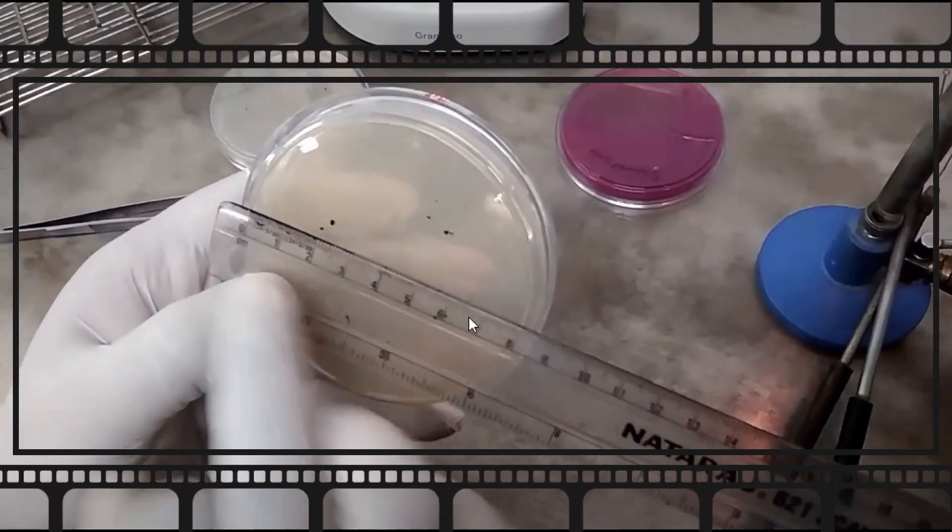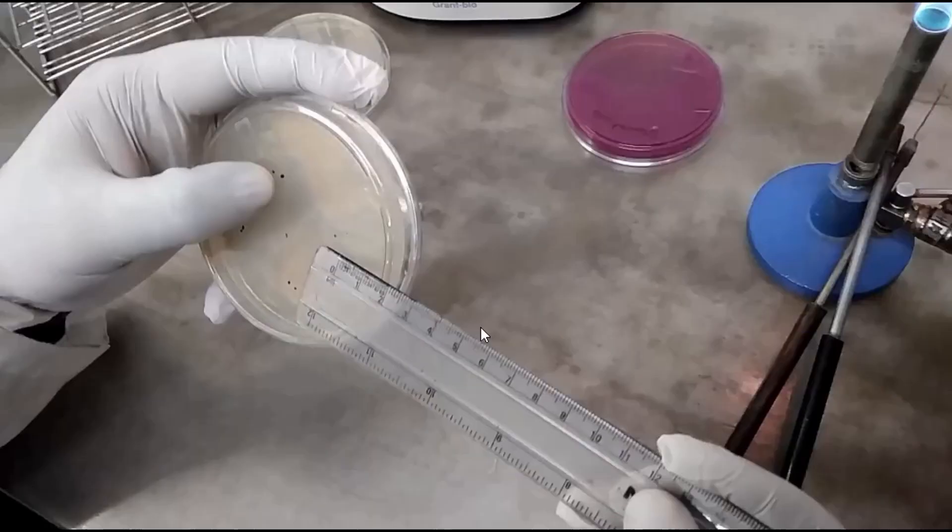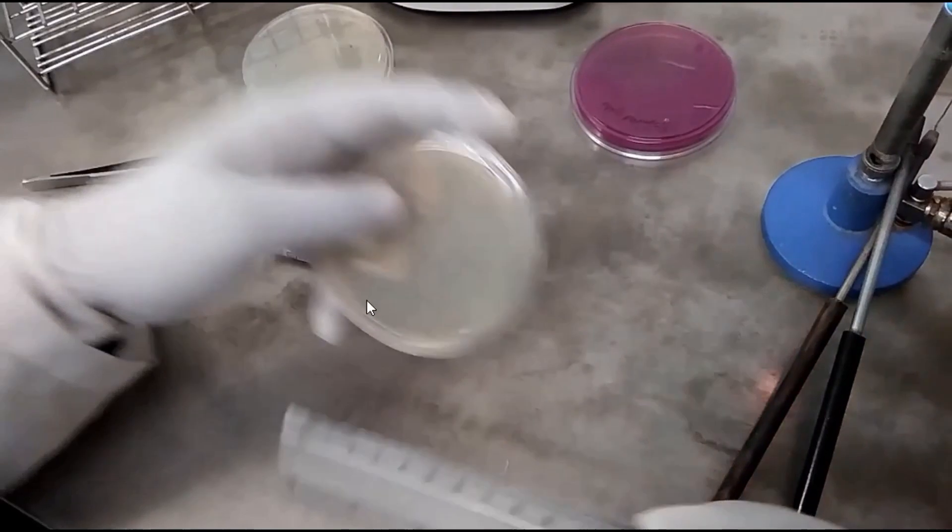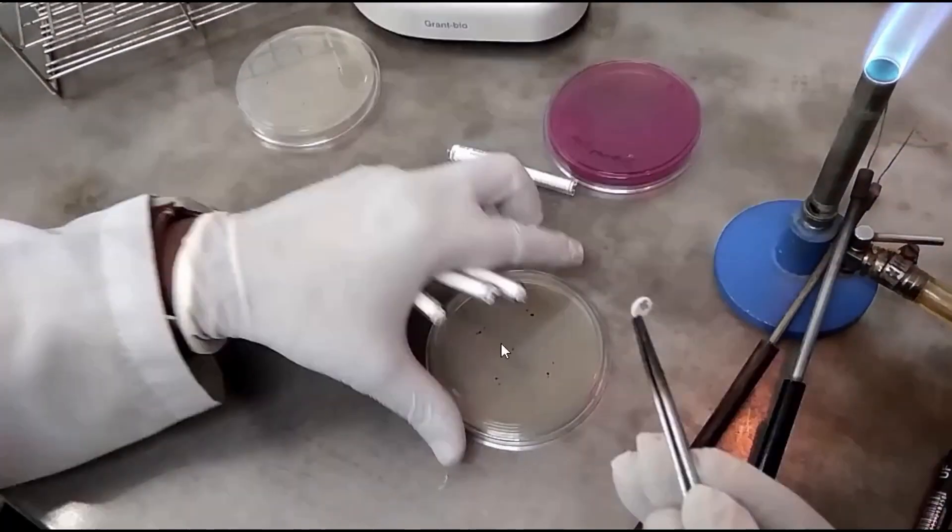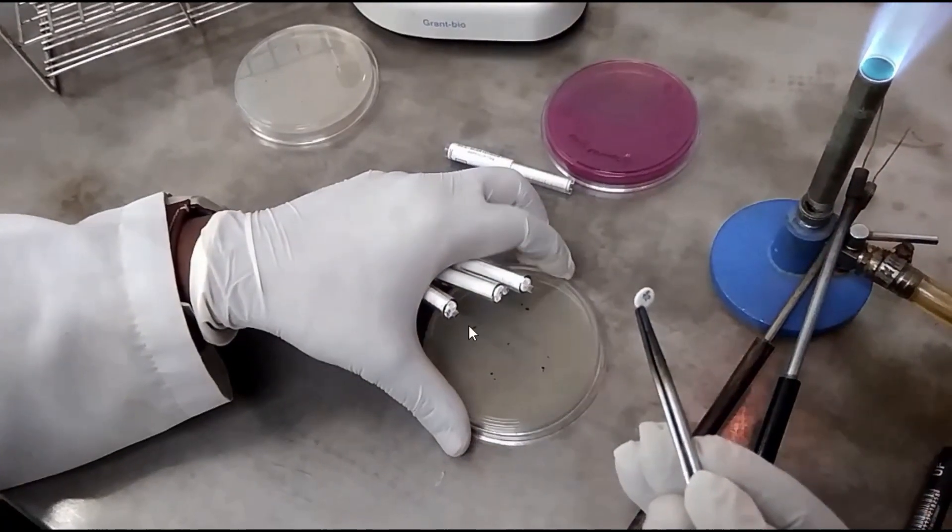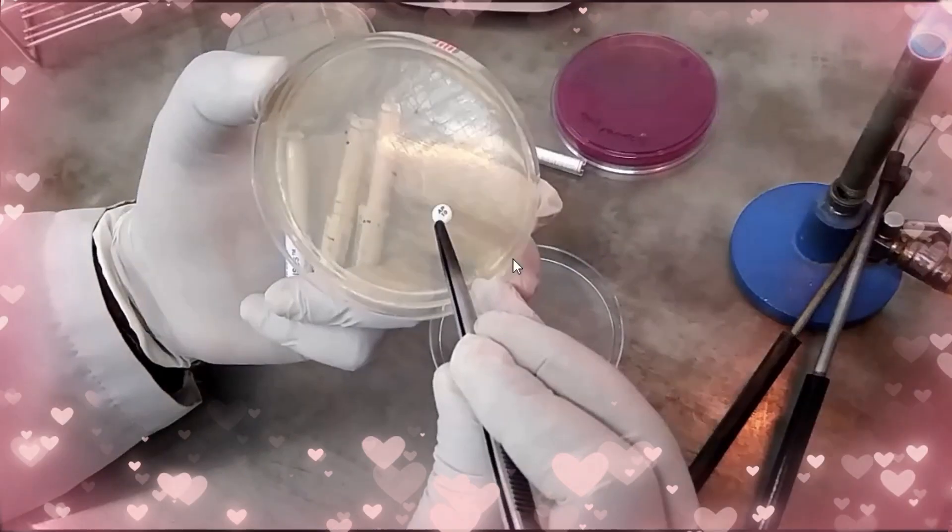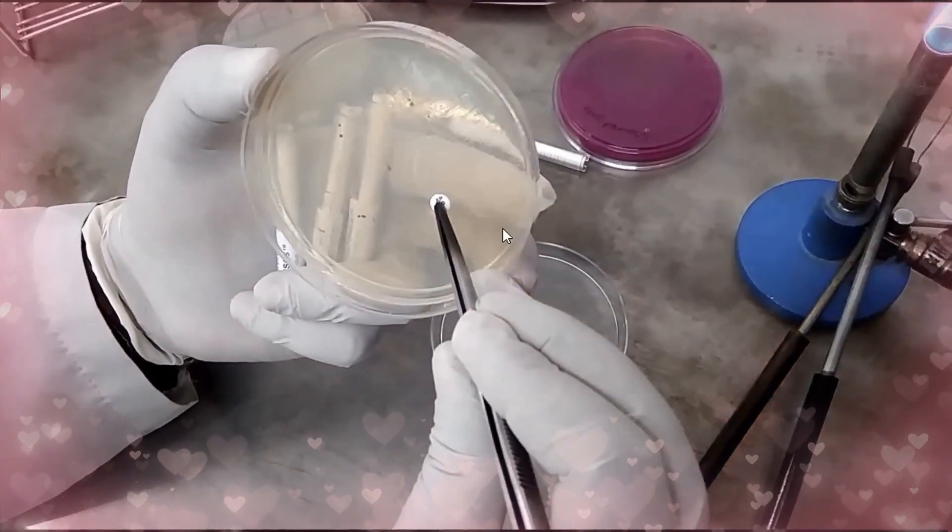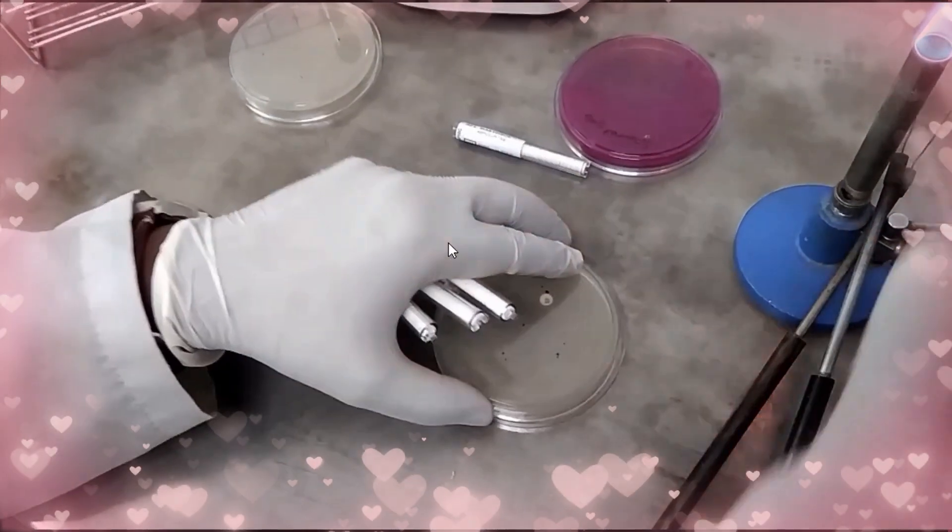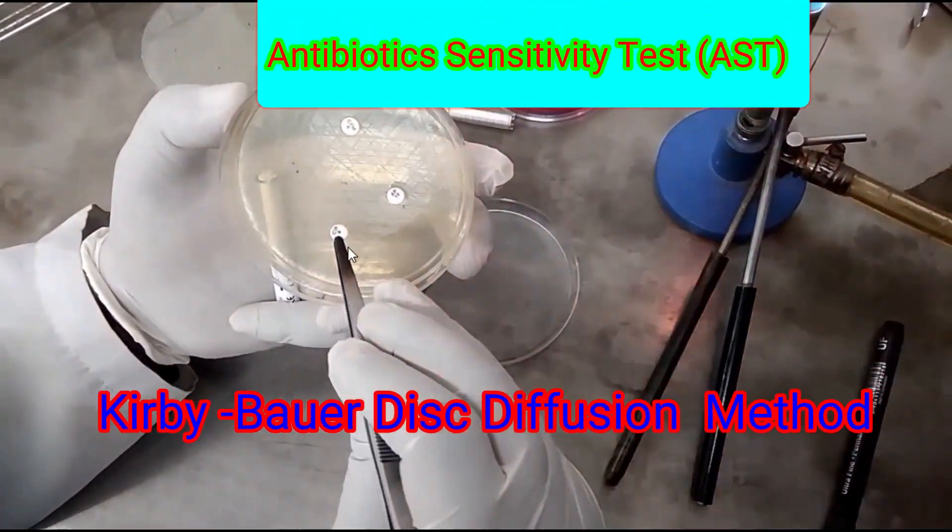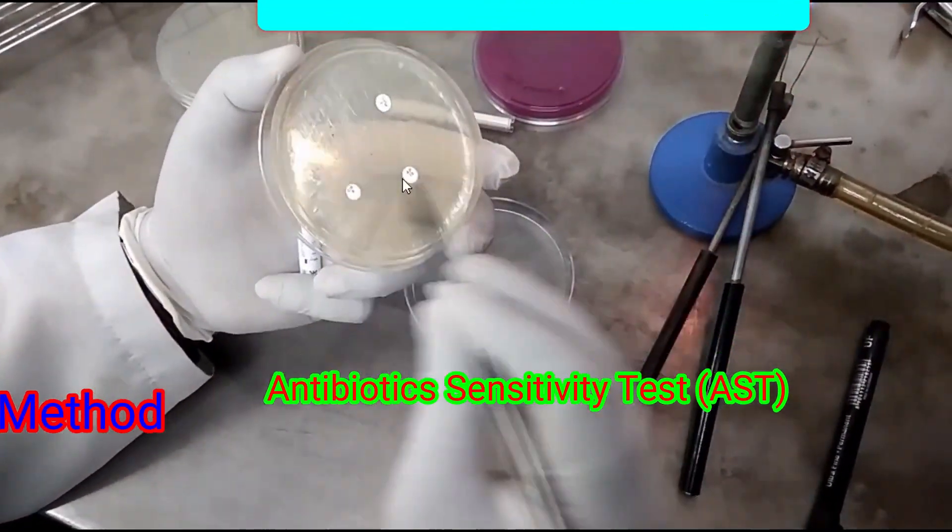So here you can see the diameter of this petri plate is only 80 mm. According to WHO, the depth of Mueller-Hinton agar should be 4 mm. The diameter of disc is 6 mm.